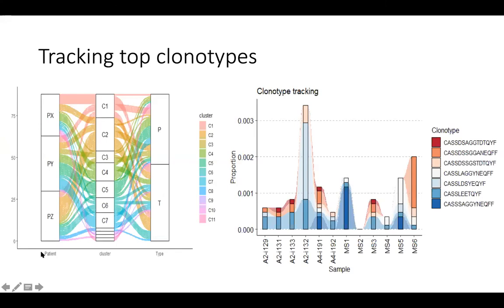That is probably the most definitive way of identifying TCR antibodies or BCR antibodies that are responding to a challenge. So let's say pre-vaccine and post-vaccine, are there antibodies that can be detected that are actually expanding, which means they're actually responding to the vaccine, right? Those are the sorts of things that can be very easily identified from such analyses.